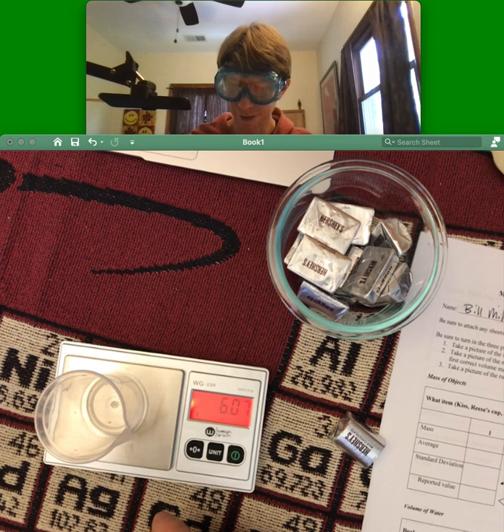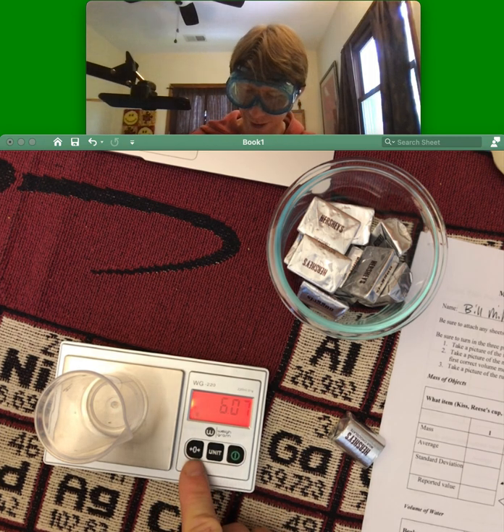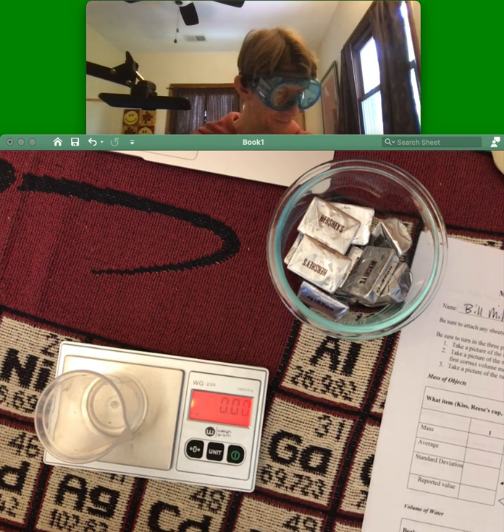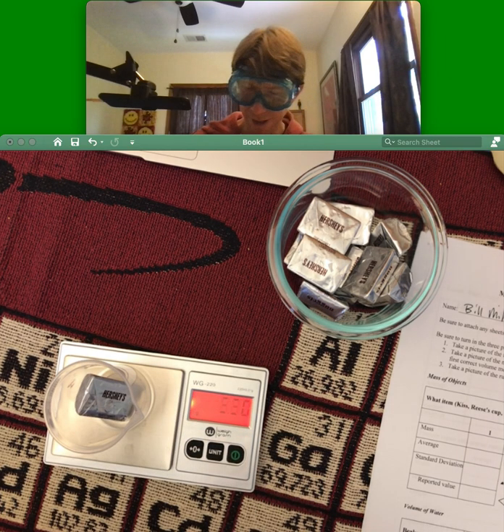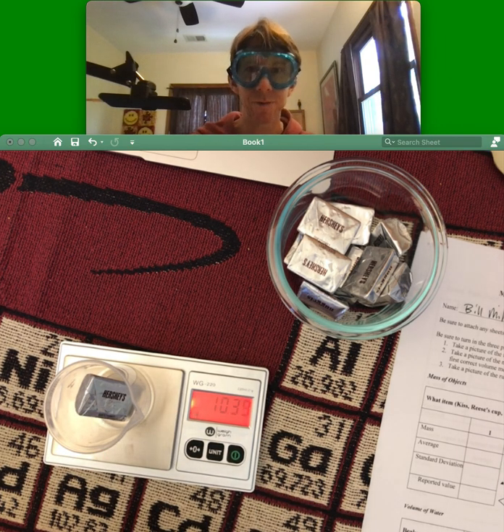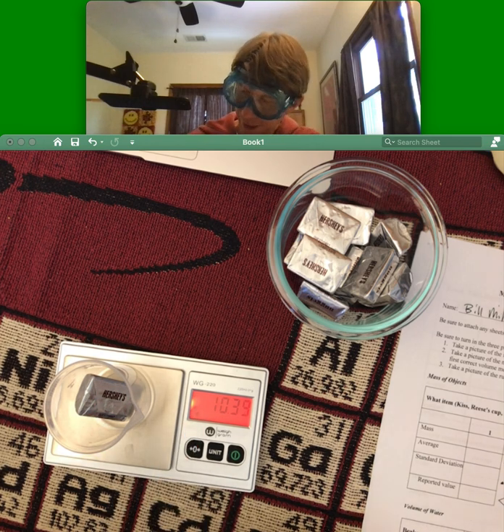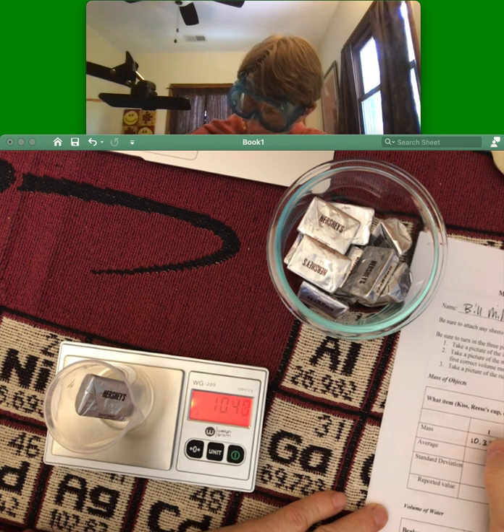It turns out my beaker is 6.07 grams, but I'm going to hit the zero button, which is this button right here. Wait for that little circle to appear, and then place an item on the scale. Wait for it to settle, and then that little circle appears. Turns out my nugget is 10.39 grams.